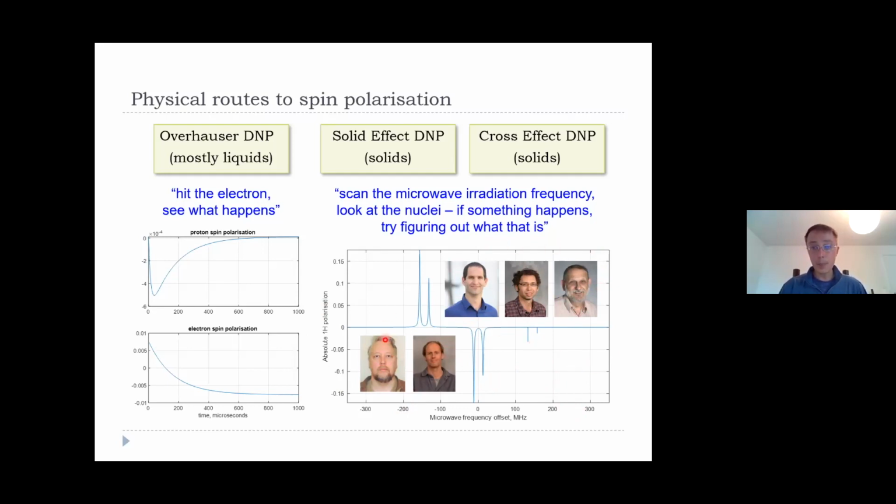In fact, it was collaboration with these fine gentlemen that got that simulation technology implemented into SPINACH. And then hopefully a phenomenon called thermal mixing emerges as a thermodynamic limit of all of this, plus the spin diffusion, plus all the mechanisms that are still unknown and being explored.